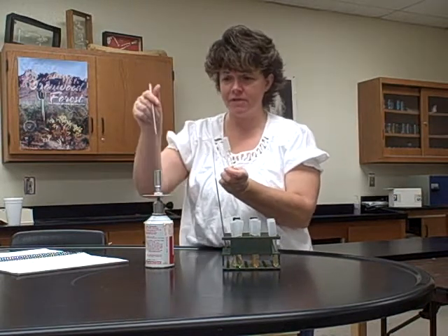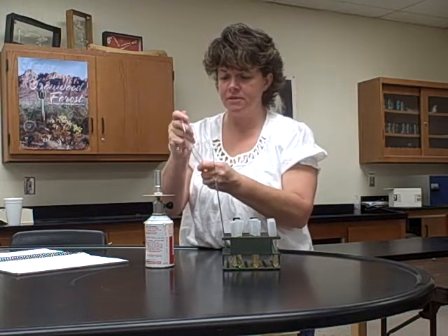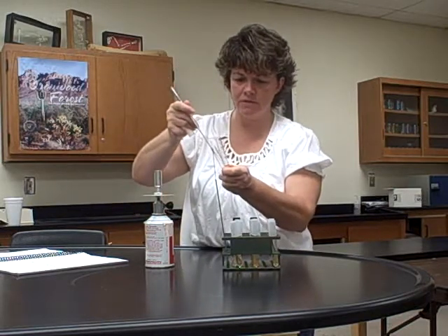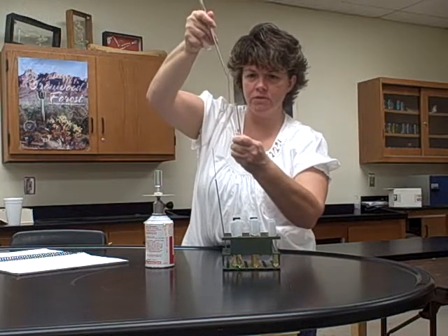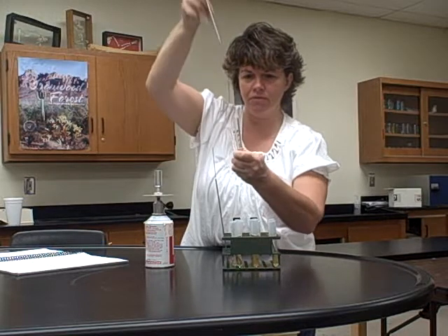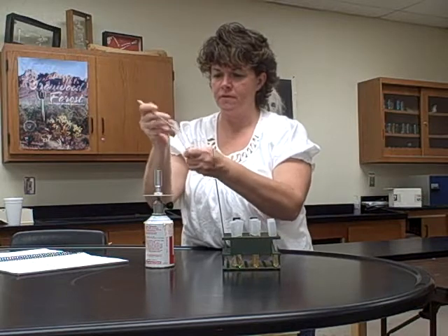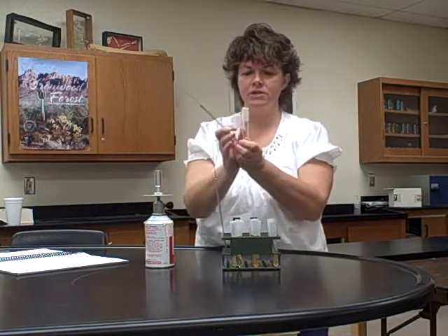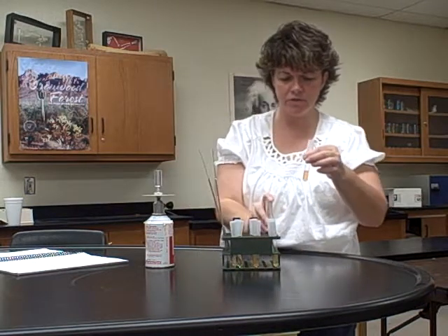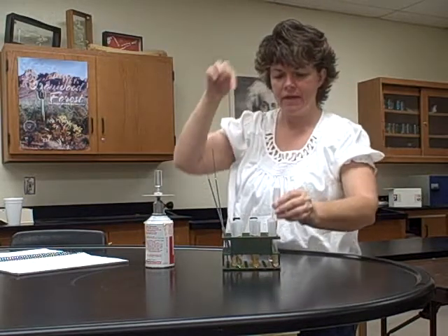So I've already sterilized my needle, okay? I'm going to take off my 2 lids, run them through the flame, go into my culture, and this time, like I said, we're going to stab it. You're actually going to push it down in one motion, in and out. Okay? So of course the straighter your needle is, the better it's going to be. So I've sterilized that. Here's my original culture. Here's the stab I put it into. So like I said, you just go straight down into it and straight out.